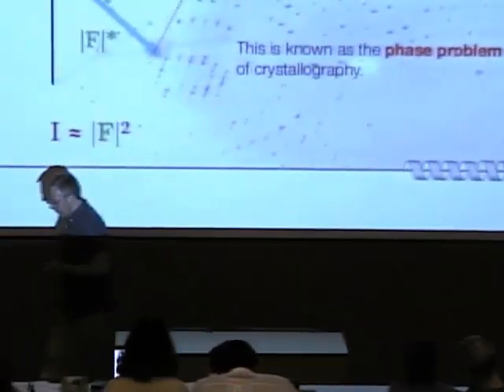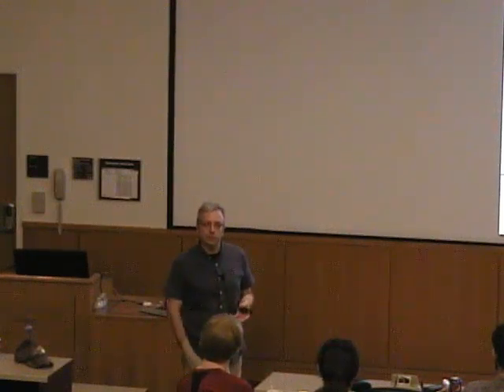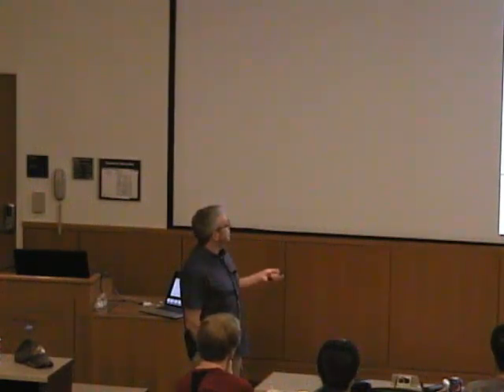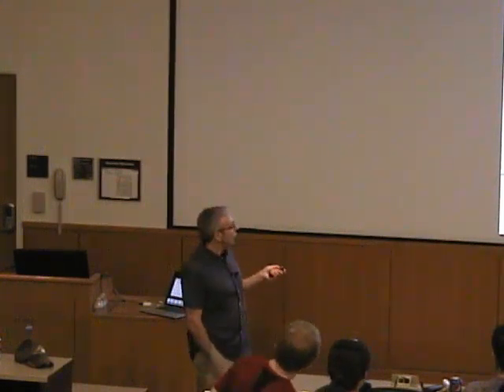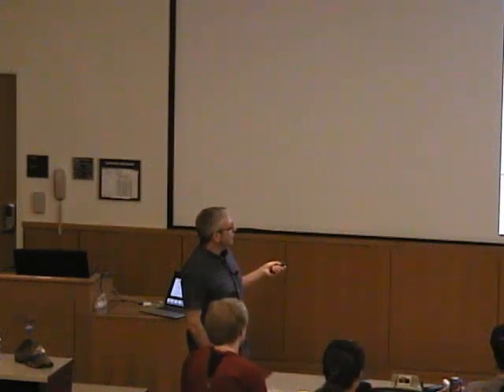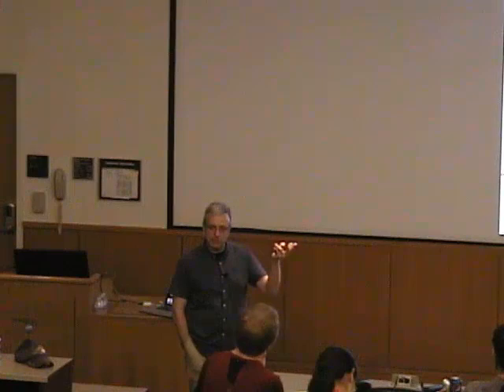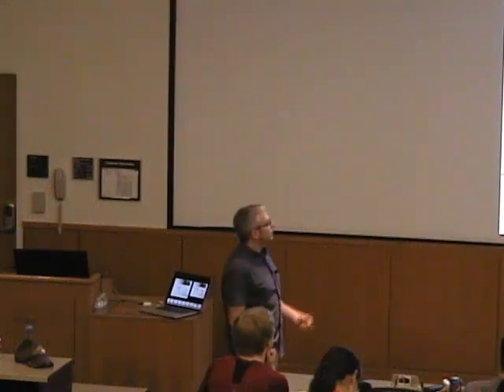And what I keep telling in the practicals is that if you ever heard crystallography from a small molecule person, they probably never told you about the phase problem, right? And that is because for small molecules, the phase problem is solved, but for proteins, it's not. So for us, this is serious. We have this equation, which is an equation of limited complexity, and all we need to fill in is amplitudes here that we get directly from the diffraction experiment. This is the Fourier term that relates the two representations in real space and reciprocal space. And that is our phase angle, and we cannot measure our phase angle.